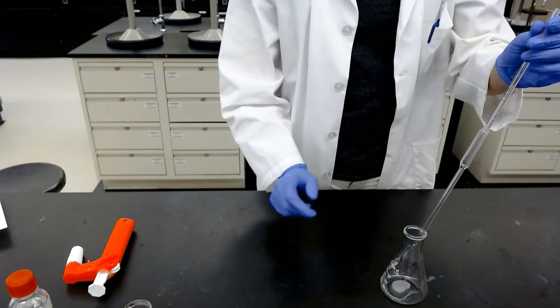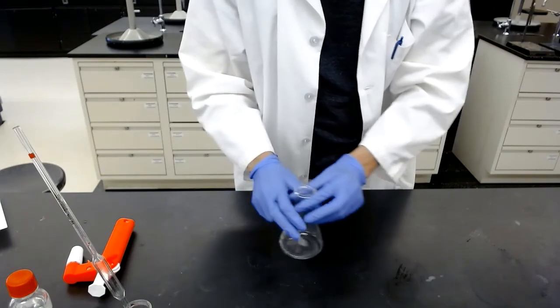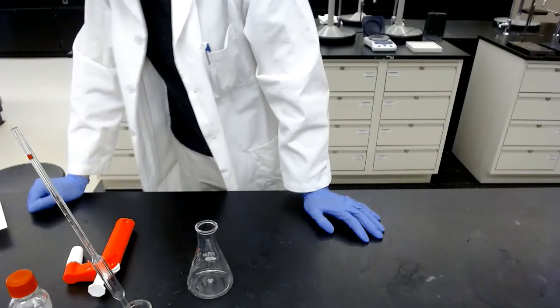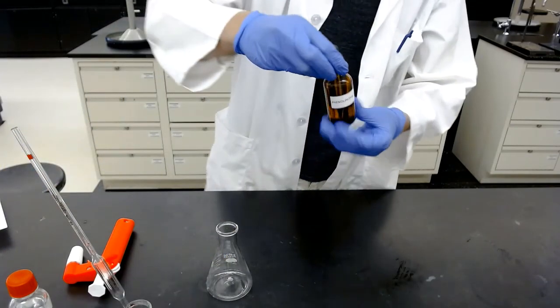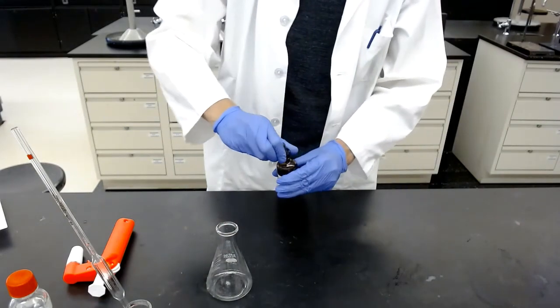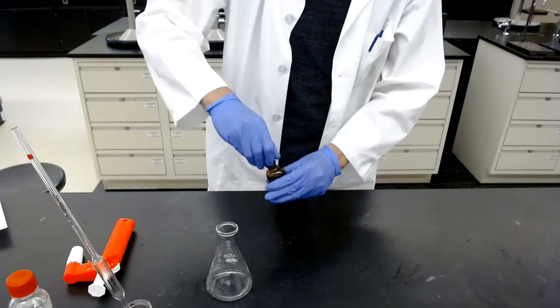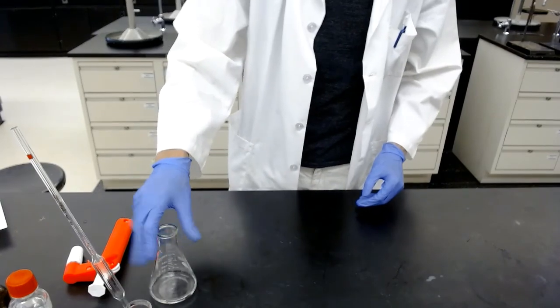After the 10 ml is finished draining, you can put that pipette back in the stock solution. Then we need to do the titration. So this is the 10 ml. We need to add the phenolphthalein indicator solution into this acid before the titration happens, otherwise it's not going to change color. A little bit of mixing, and this solution is ready to go.